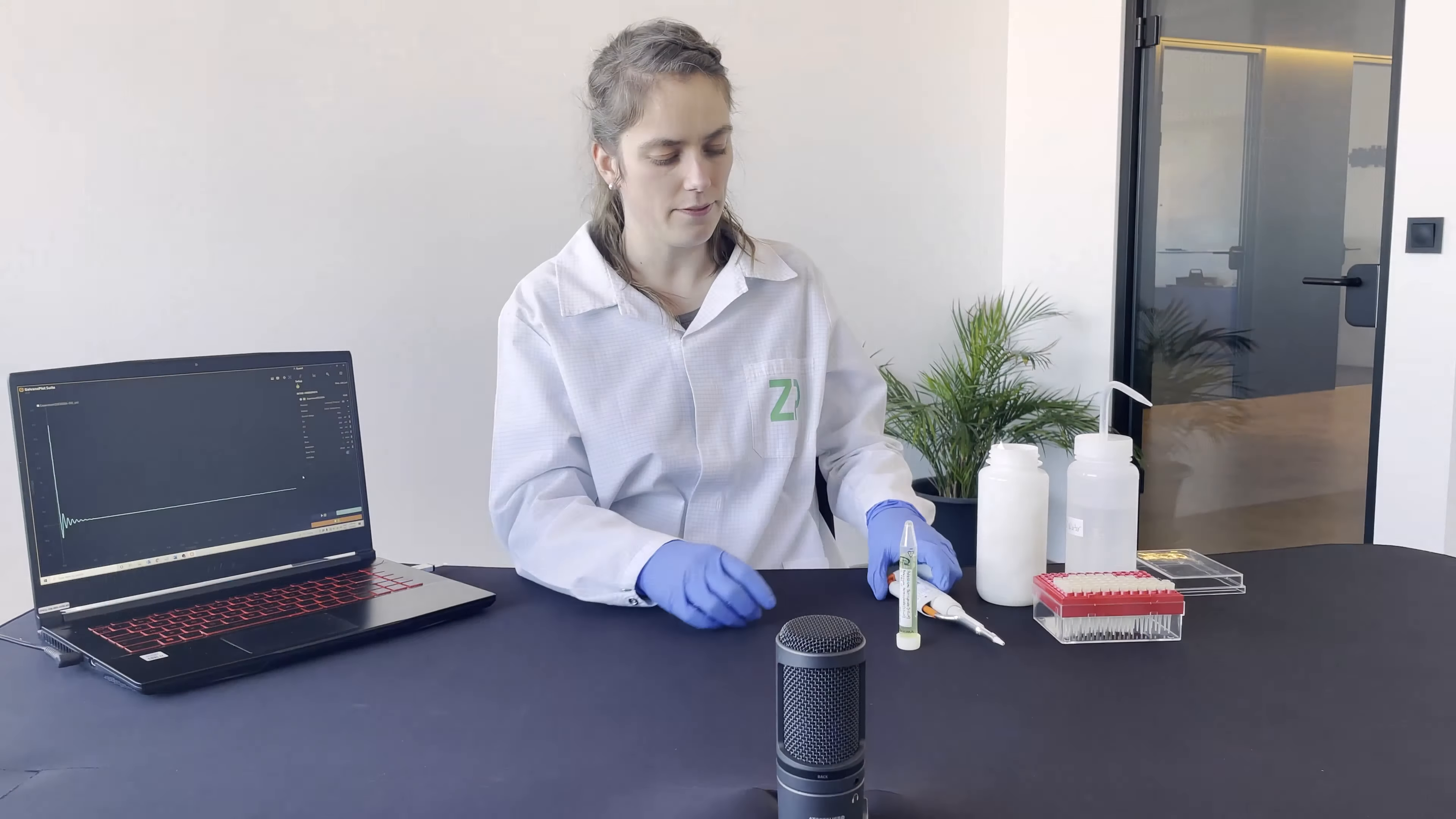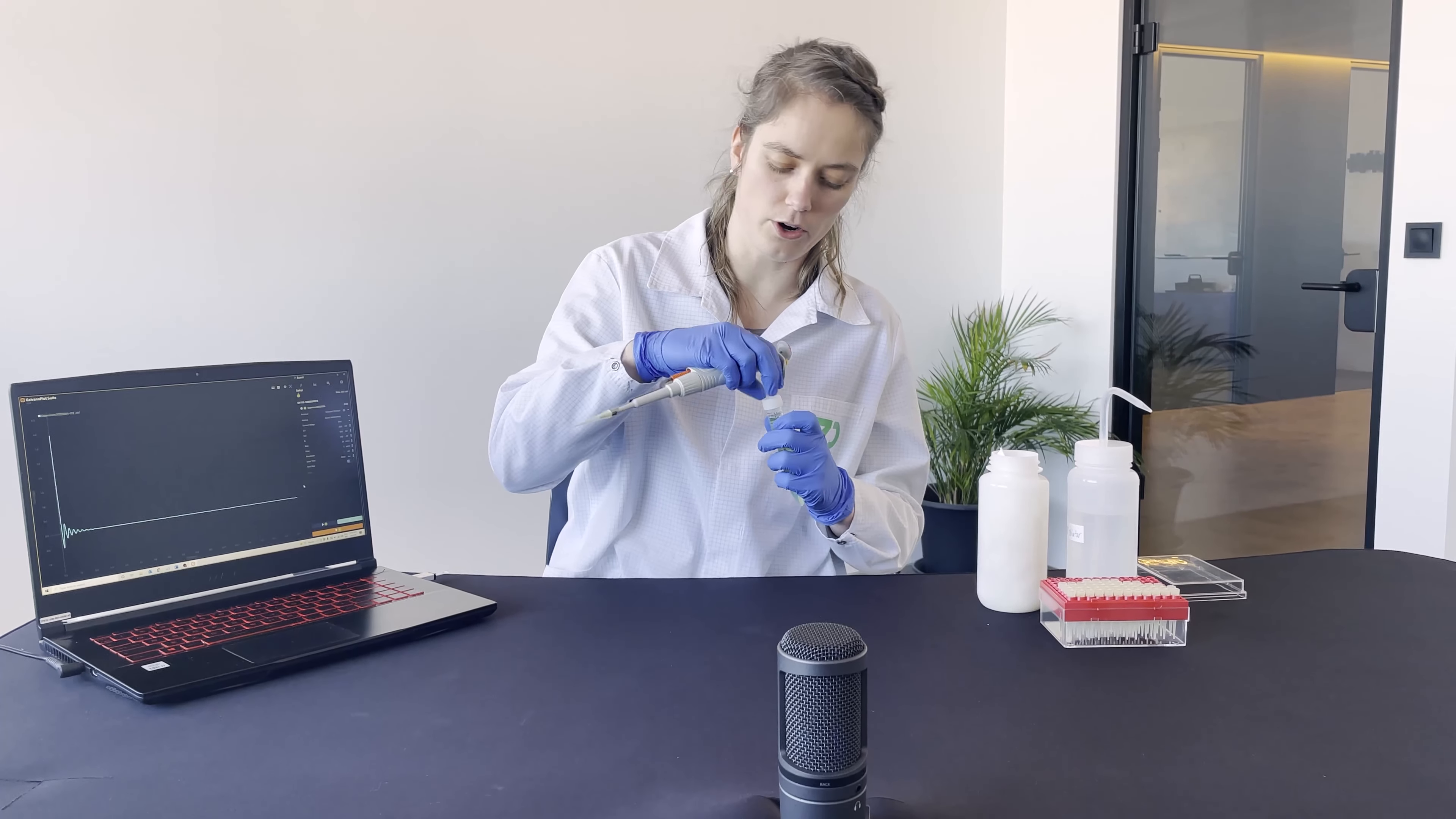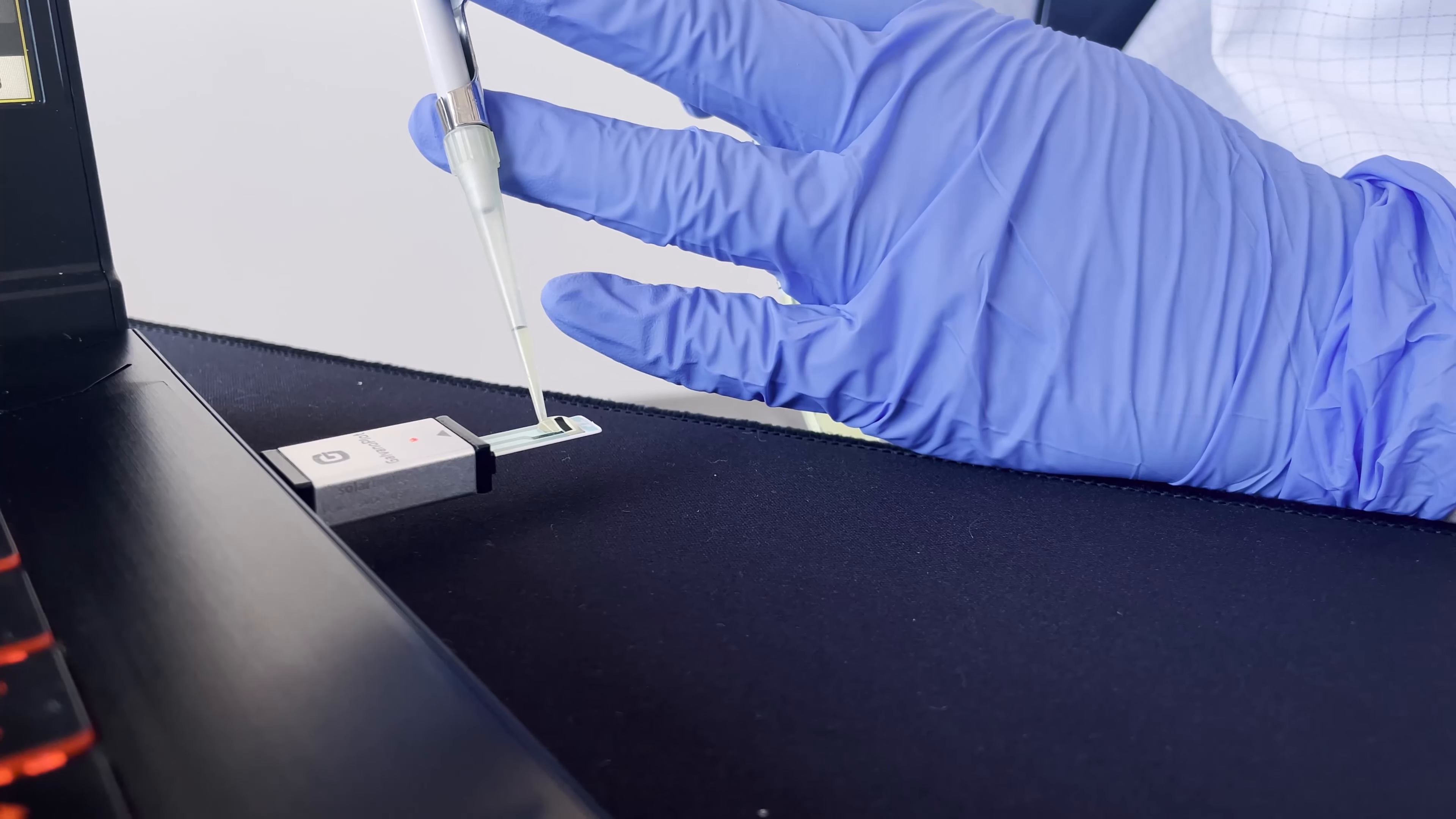Next, we need to cover the electrodes with the solution. We will use approximately 50 microliters, which is sufficient for covering the electrodes. We will pipette it onto the sensor and make sure we cover all three electrodes.